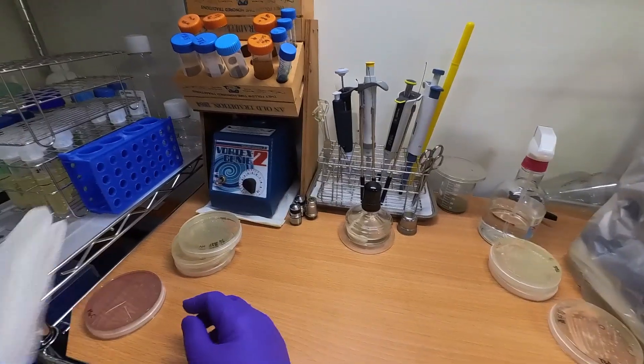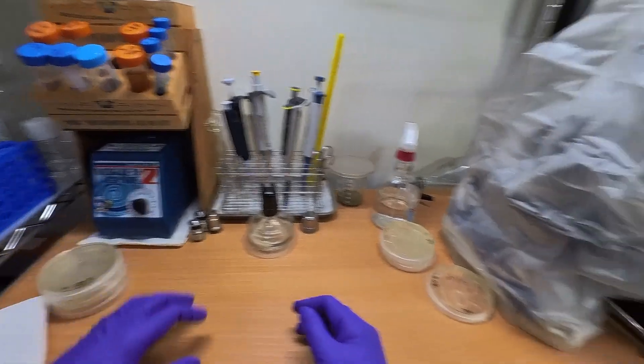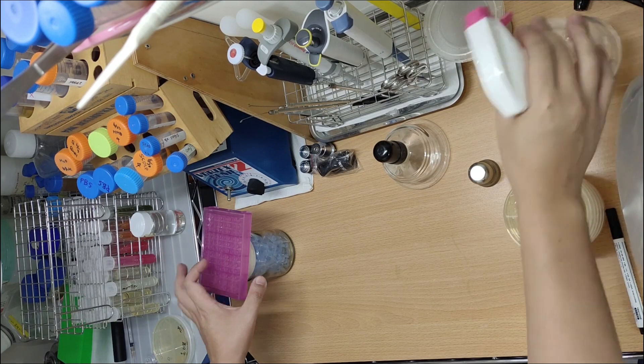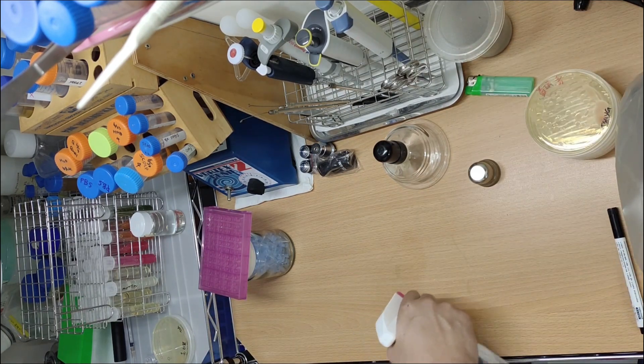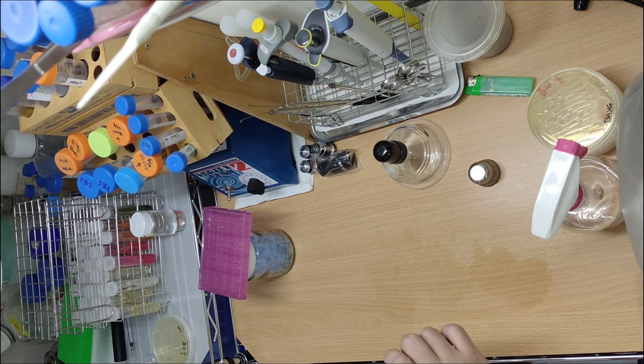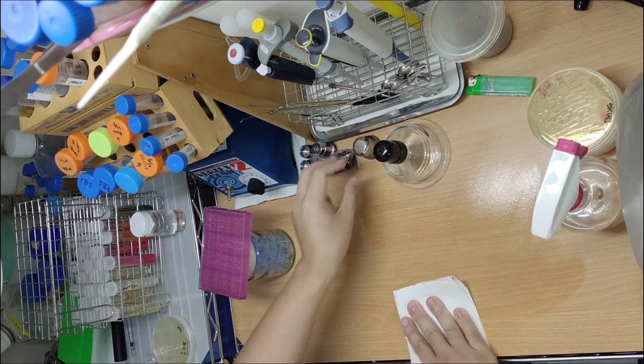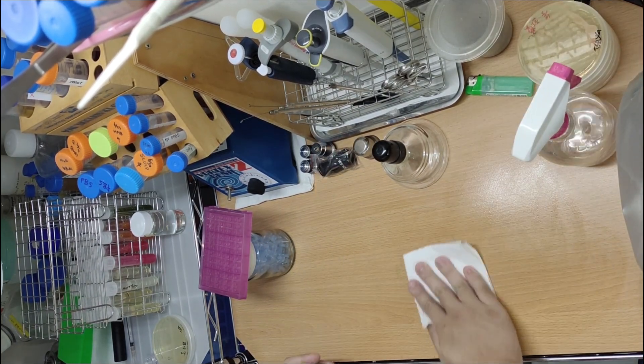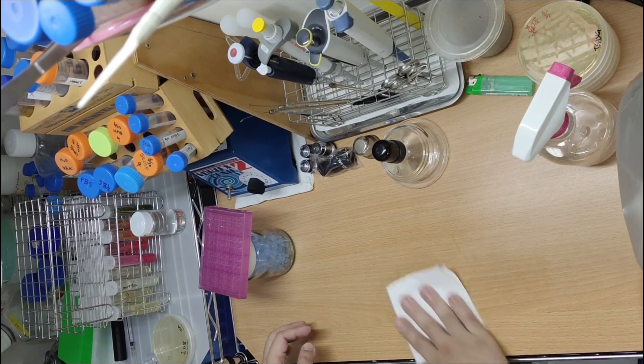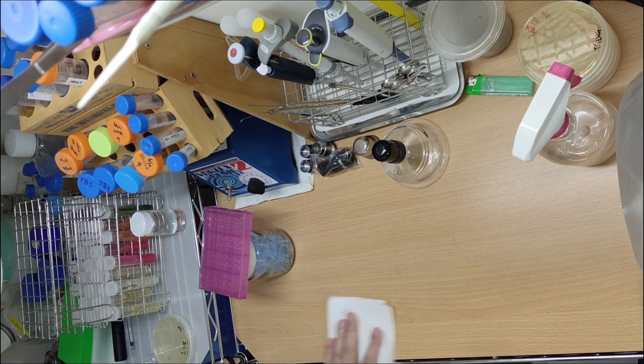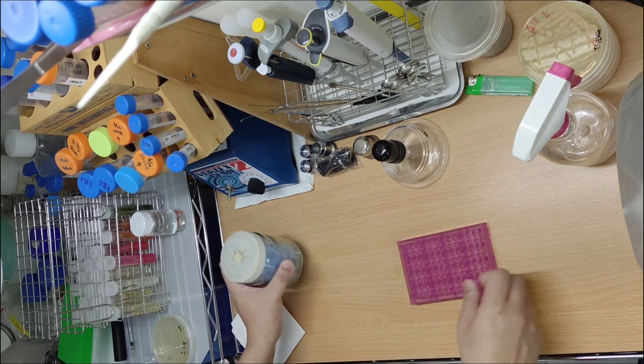For example, I test whether the bacteria can ferment sugar by acid production. The sugars I use in the test are just glucose, lactose, and sucrose. But there are more than 40 different sugar types and more than 90 different carbon sources that you can test with. So there's just not enough information from those tests I did to let me or anybody else identify those bacteria correctly.